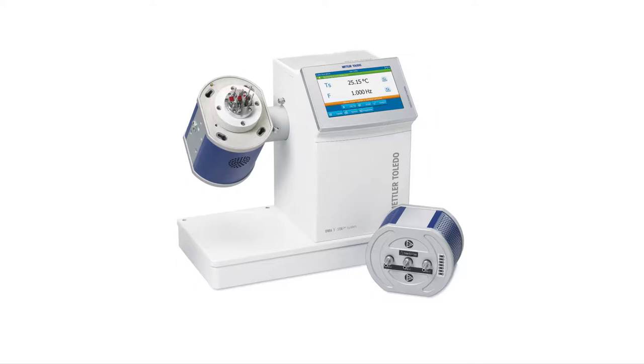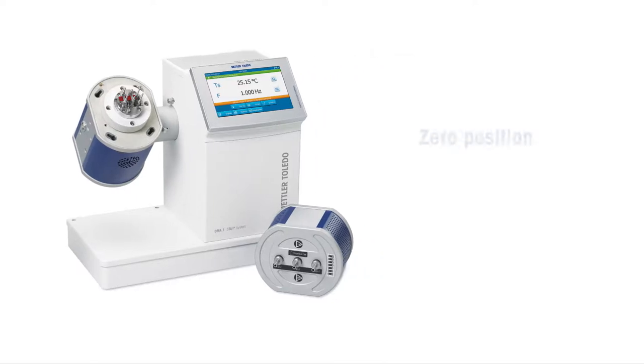We will now show you how to calibrate DMA1 for zero position, displacement and force. Temperature calibration is shown in a separate video.